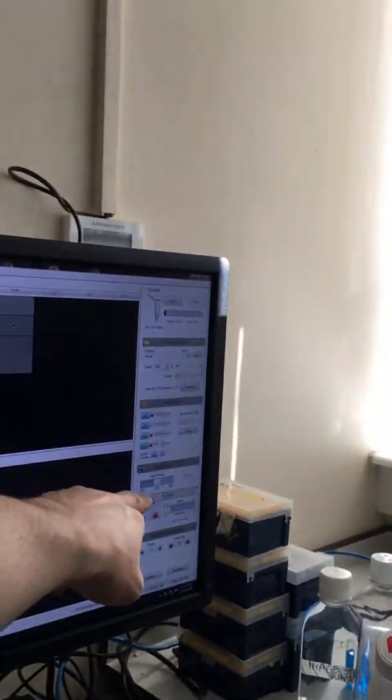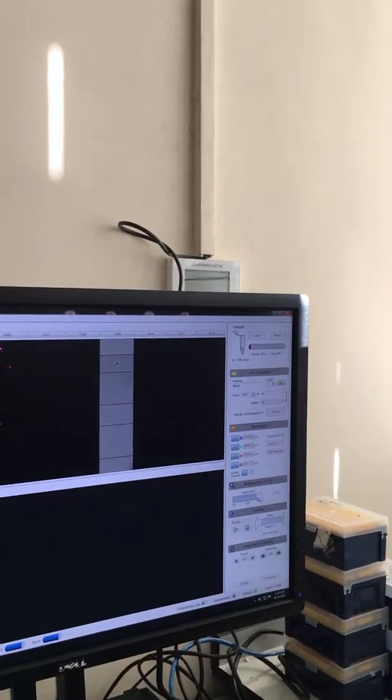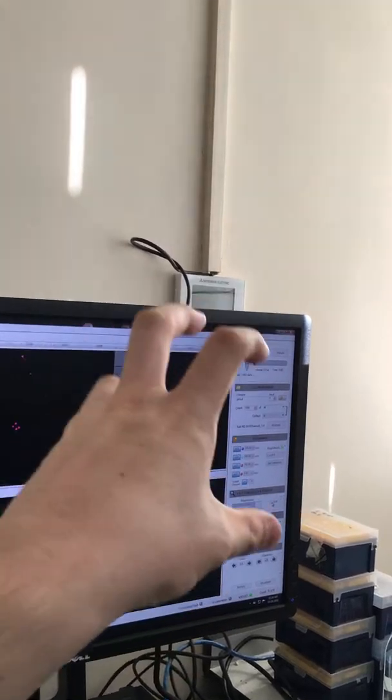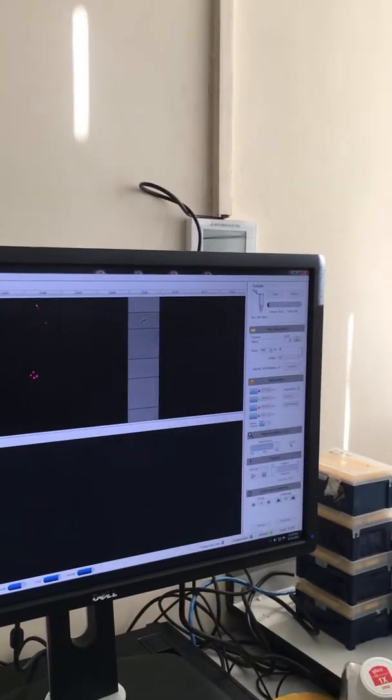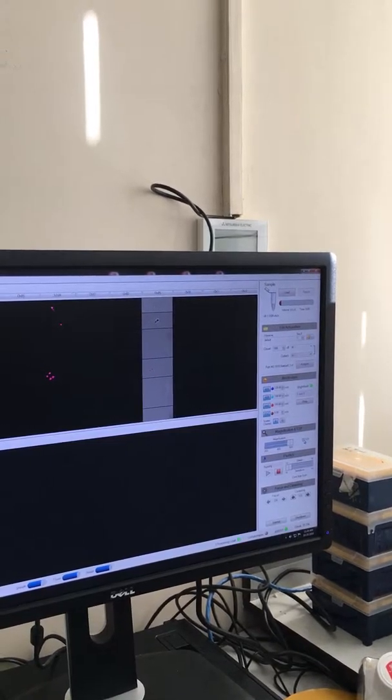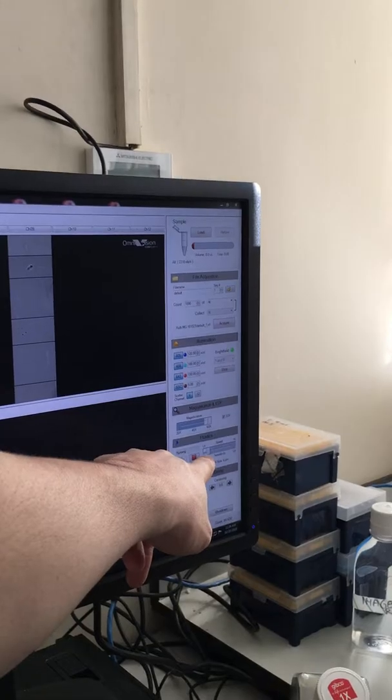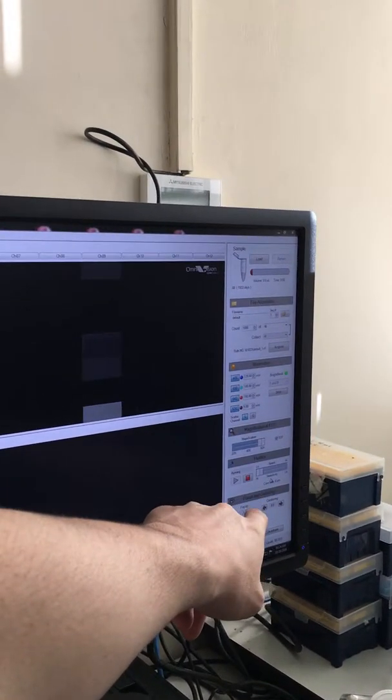You want to change magnification to 60. And then you want to turn on EDF. We have to wait to let the camera move to places, and when it's not grey you can press EDF. Your speed here is on low, which is good, which means your sensitivity is high. So leave that.